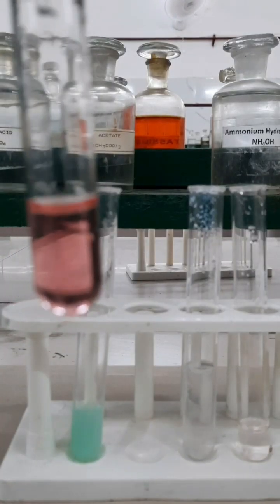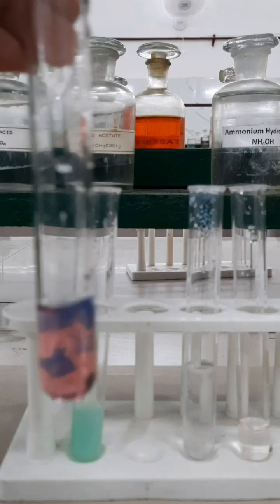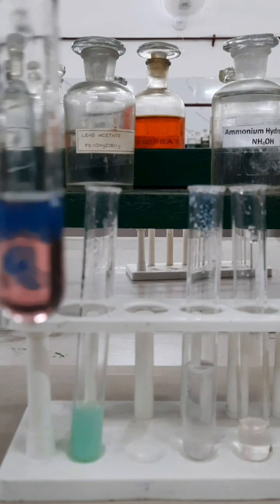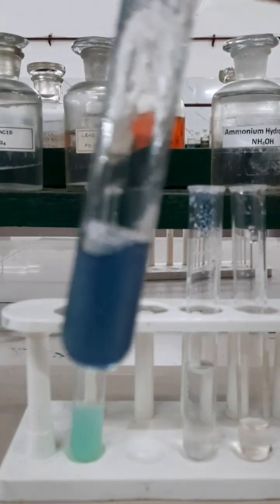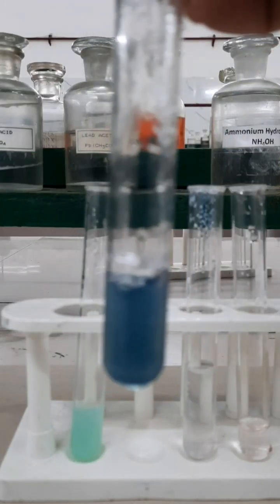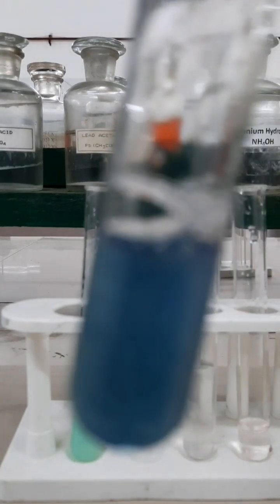In another test tube I have taken the aqueous solution of cobalt acetate and now I am adding sodium hydroxide solution into it. A deep blue colored complex of cobalt hydroxide will be obtained. It is a tetrahedral complex and it is deep blue in color. Now this blue colored tetrahedral cobalt hydroxide complex solution will be obtained.